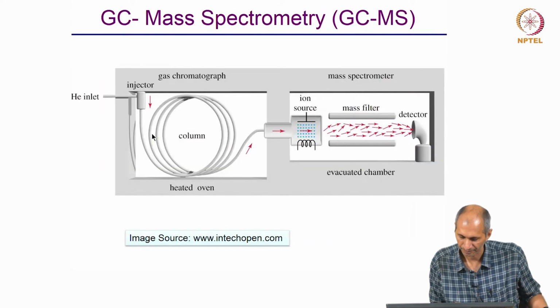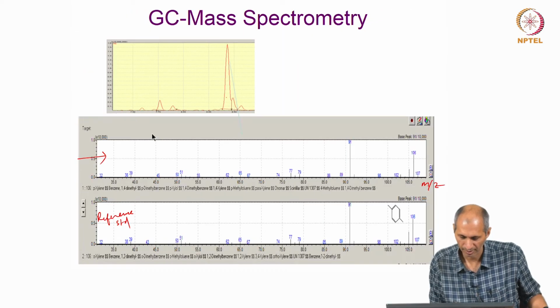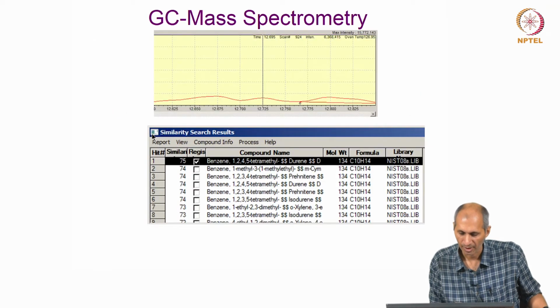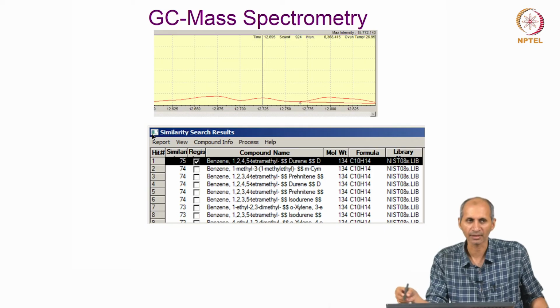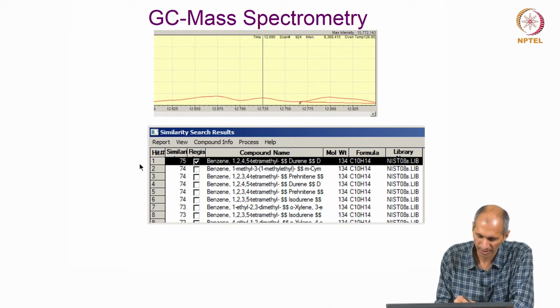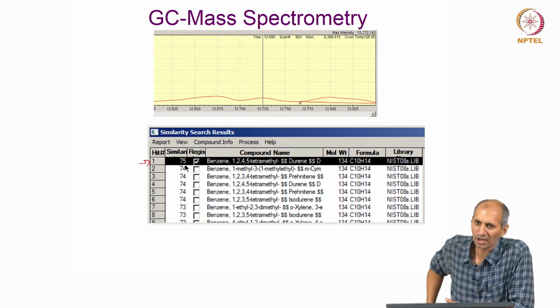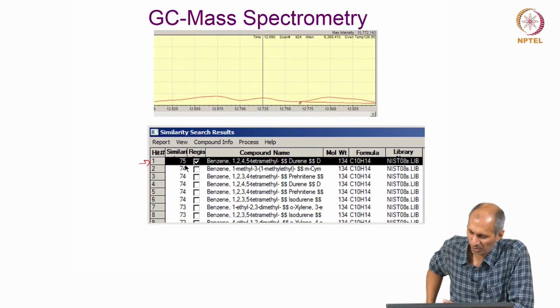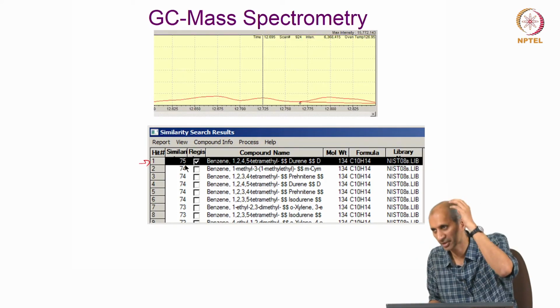Yeah, so we talked about this. Now, sometimes if you have very small peaks like this, you may get a similarity search that says 75%. It's your call whether you are okay with 75 or not. You will get a similarity match of 30%, 40%, 80%, 95%, 98%.